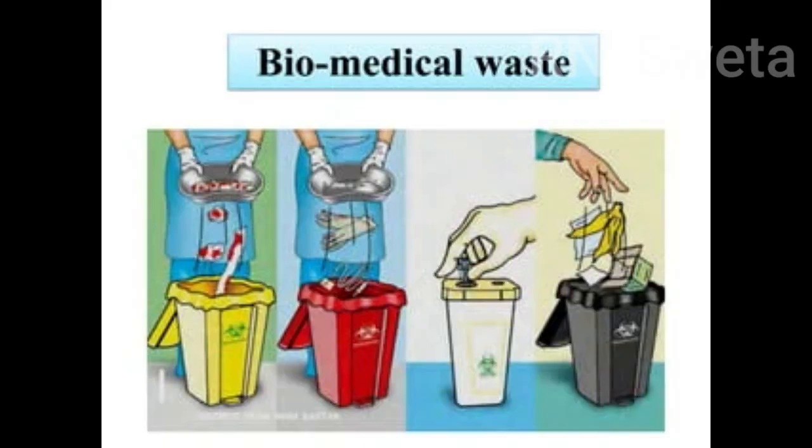After removing the PPE kit step by step, make sure that all the one-time use equipment has been discarded appropriately according to the color codes of the hospital that you're working in, according to the biomedical waste management that your hospital follows. Okay, and then whichever equipment has to be cleaned and reprocessed, please follow the guidelines of the hospital that you're working in and make sure you discard it in the proper way.